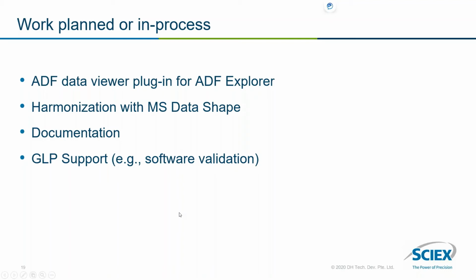We need to implement GLP support, so we would be producing software validation documentation, user documentation, and so on.